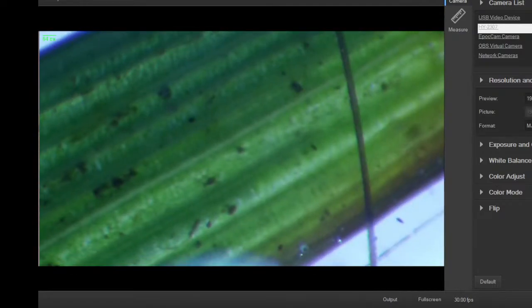Big enough, it might be a paramecium. Oh, wait a minute, no, it's a rotifer. I know that motion anywhere. It's doing that inchworming motion like a rotifer does. There you go. So this is 1,000 cells roughly, instead of a single cell. Rotifer. I don't know if I can get any closer, that's about it either. No, that was max light for this setup.